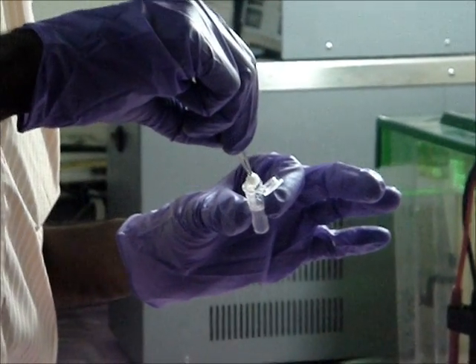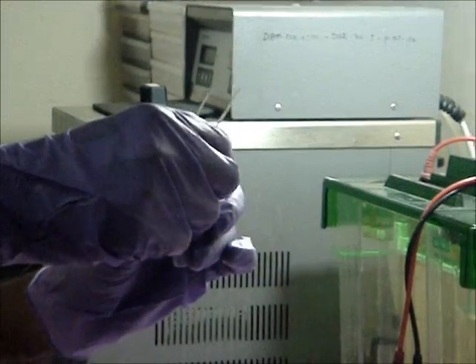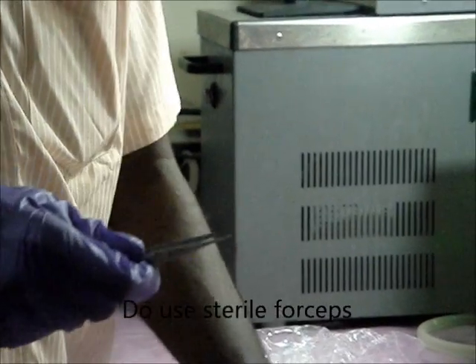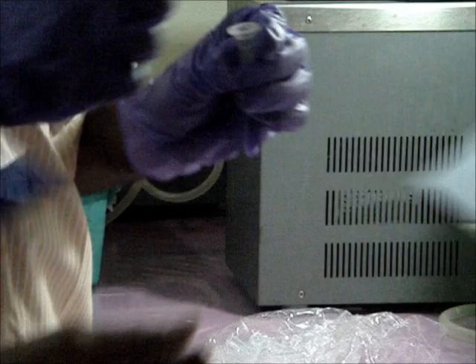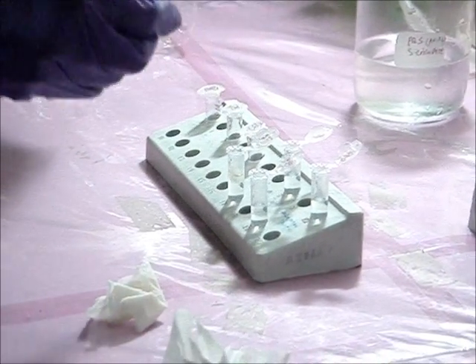Rinse the silk glands in Phosphate Buffer Saline. Repeat the procedure twice.